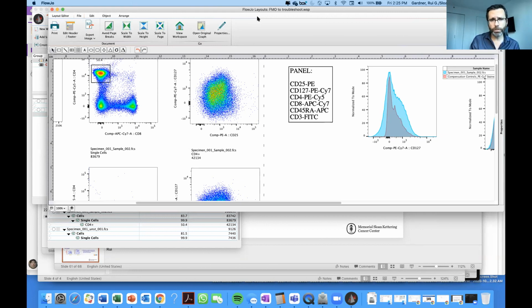I don't know if there's any question. I just saw one coming here in the Q&A. Is it common practice to group FMOs together in one tube? And do you need to test single versus grouped FMOs when optimizing? First question, no, we don't add the FMOs together in one tube. It may be difficult. I mean, if you have some kind of barcoding, maybe you could, but no, it's common practice to actually have different tubes for the FMOs to simplify, and to avoid any possible interaction between the samples. And then the next question was, do you need to test single versus grouped FMOs when optimizing?